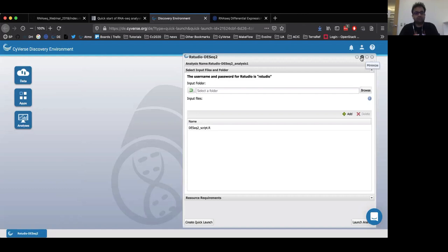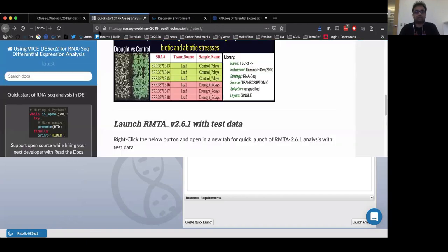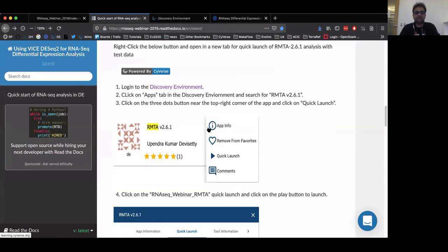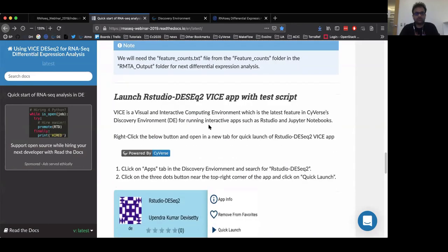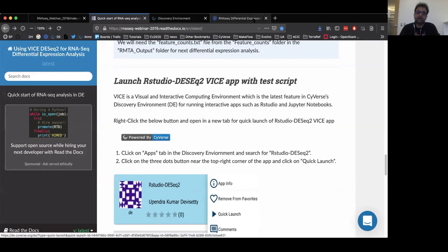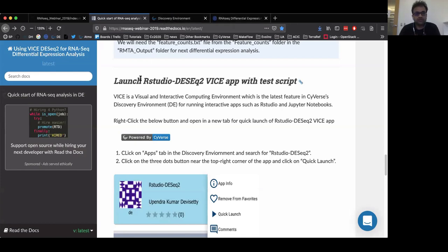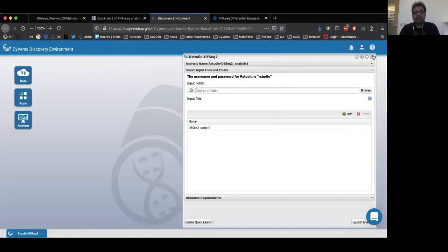For the purposes of this webinar, I have already performed the RMTA for these samples and will now move on to launching the DESeq2 app for further differential expression analysis. To launch this app, we have provided a quick launch button, or you can also search for it from within the discovery environment, which I'll show you right now.